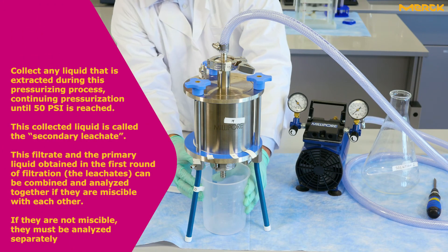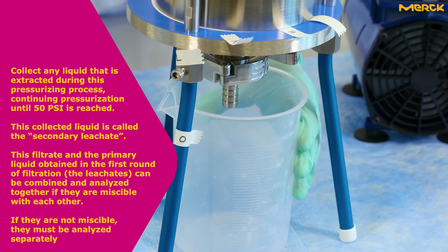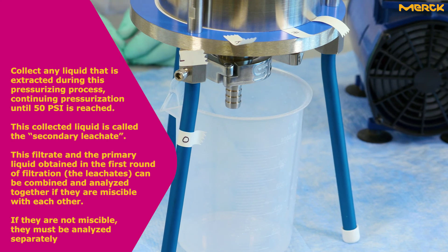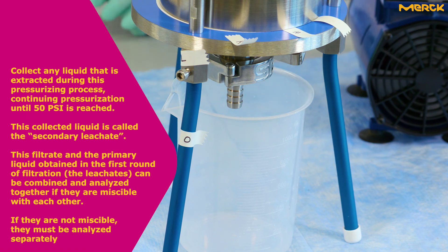Collect any liquid that is extracted during this pressurizing process, continuing pressurization until 50 psi is reached. This collected liquid is called the secondary leachate. This filtrate and the primary liquid obtained in the first round of filtration — the leachates — can be combined and analyzed together if they are miscible with each other. If they are not miscible, they must be analyzed separately.